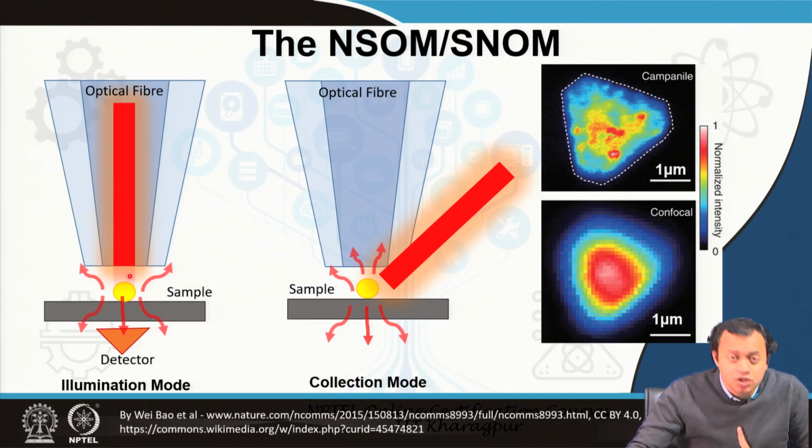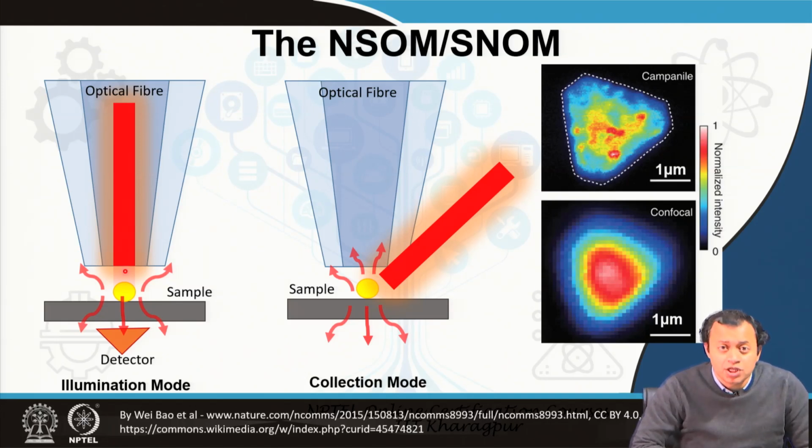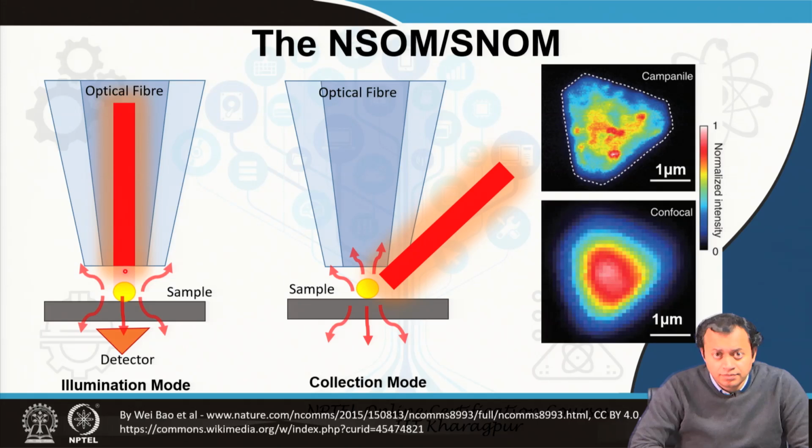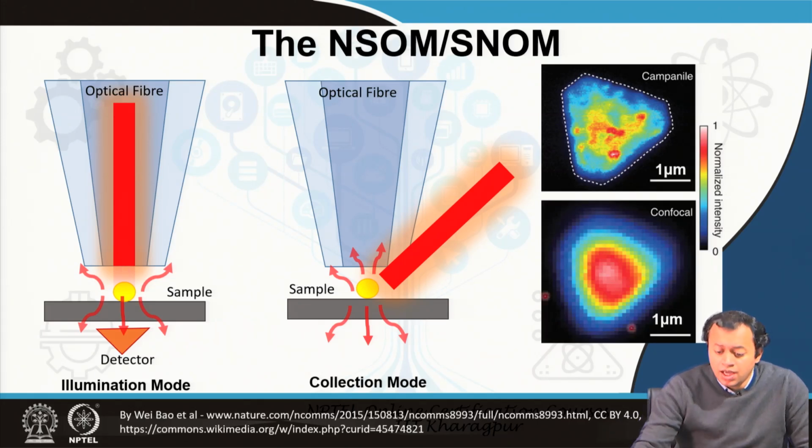This 0.1% of the light, we are bringing it close, and the effect by this 0.1%, 0.01% light with very meager strength, with very meager amplitude, whatever it can generate, 1 photon, 2 photons, 1 electron, 2 electrons, that much sensitivity we have that our detectors are able to detect that, thanks to nanotechnology.